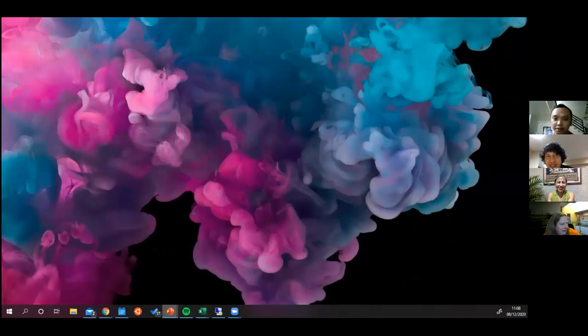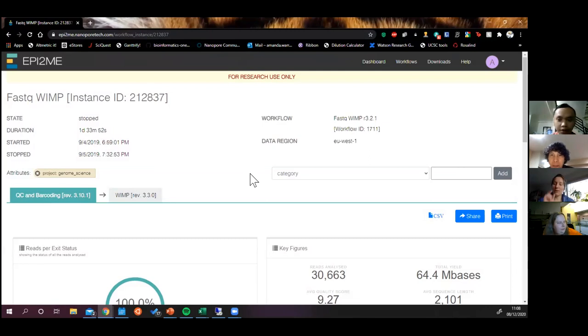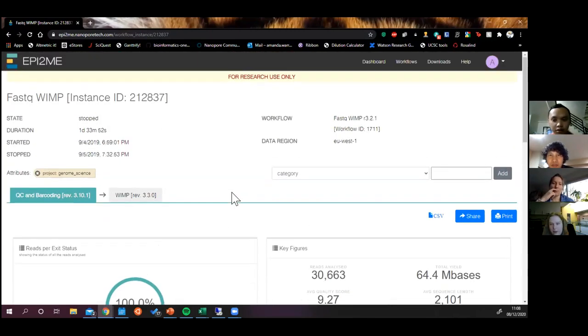So this is actually a good moment for me to bring up my Epi2ME thing. Am I still sharing the screen? I think I am. Yes. Before you start, Amanda, have you used Epi2ME? Yes. I said I used the kit in the pub. This is the results from that.